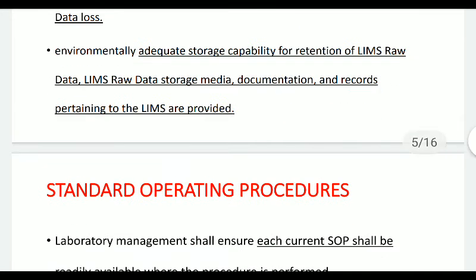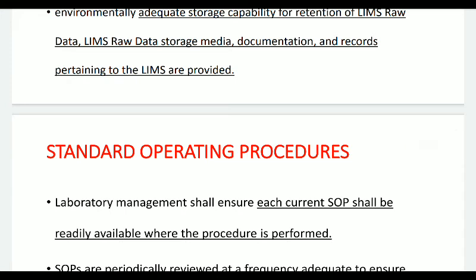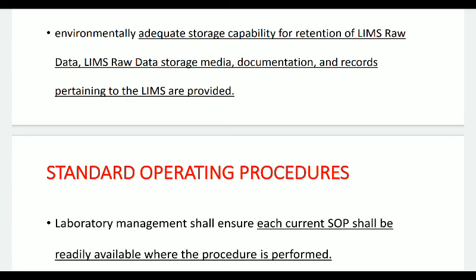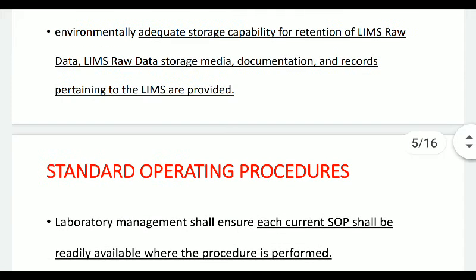Environmentally adequate storage capability for retention of LIMS raw data, LIMS raw data storage media, documentation and records pertaining to the LIMS are provided. Many times we have seen that due to a fire hazard or any other hazard, in a company there is a considerable loss of documentation or a considerable loss of data.